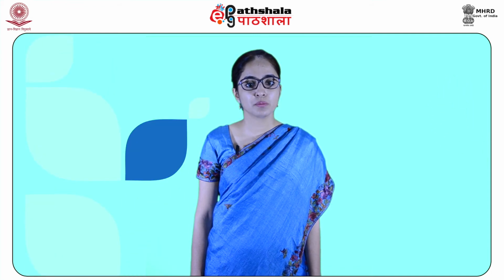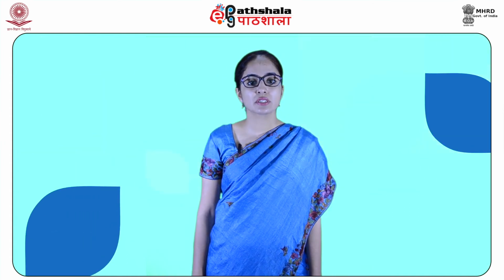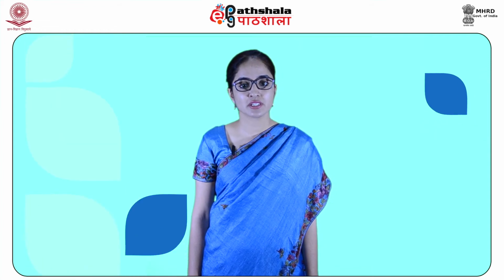It is one of the more routine NMR techniques, as phosphorus-31 has an isotopic abundance of 100% and a relatively high gyromagnetic ratio, which is 40.5% of that of proton.